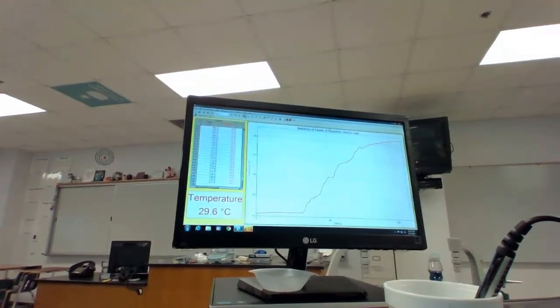I'm going to give it a few more seconds here for it to finish up. It naturally is going to stop at 300 seconds. So I did add in a few more seconds, and you might notice that in fact the temperature is now beginning to go back down again, and so I am giving it time to finish up things.